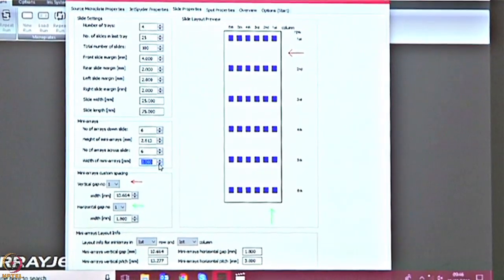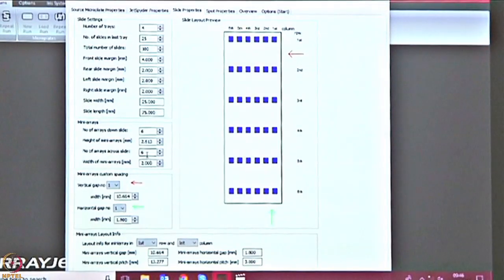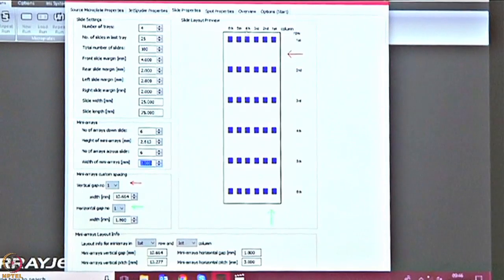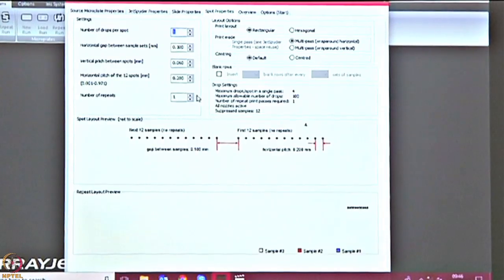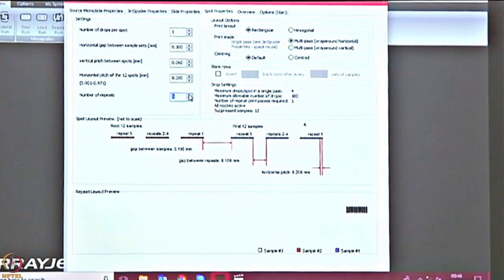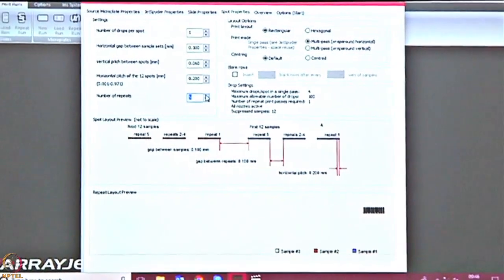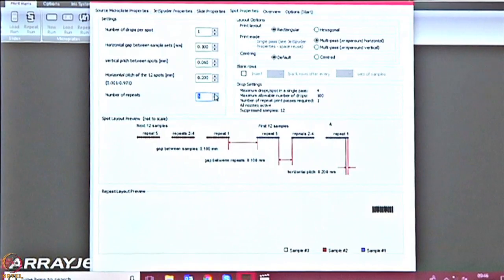So you can multiplex it. So right now I have given it several squares. And I can duplicate it. So most of the work in proteome is obviously you want to get high reproducibility, so you duplicate, you triplicate it. So the HuPro is about duplication. So you've got 19,000 times 2 features. I can triplicate, so this is how it looks.